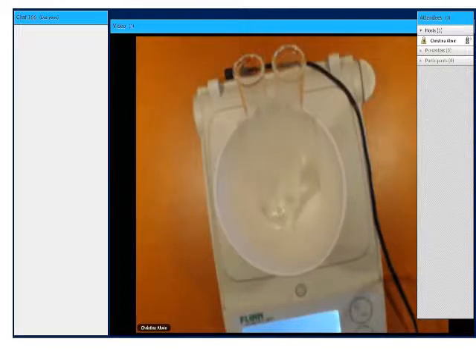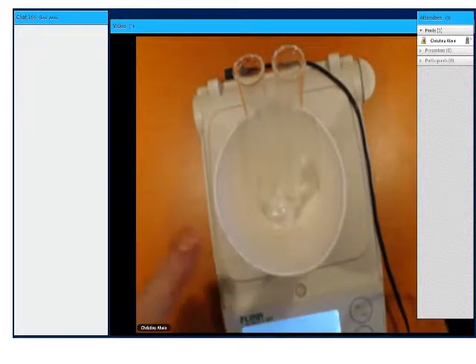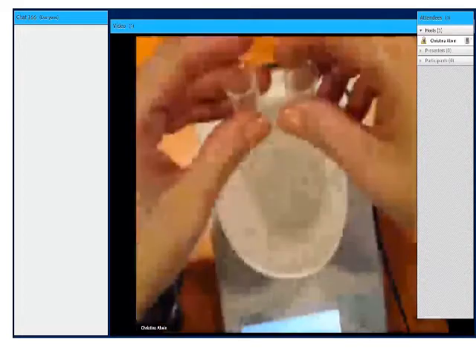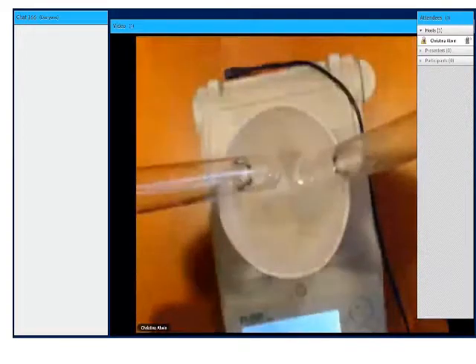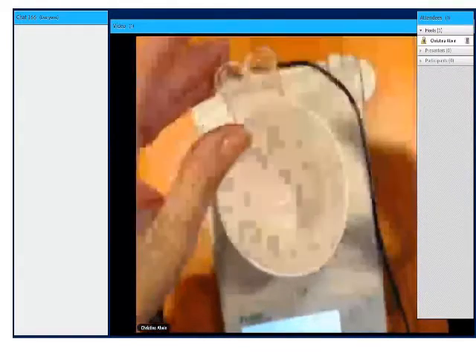This video is to show you some evidence of chemical reactions as well as to show you the law of conservation of mass. On my scale here, you'll see that I have a cup and I have 2 test tubes in it, and you'll notice that I have a clear liquid in both of these. So my liquid is clear as I start, and we also need to make note of the mass.